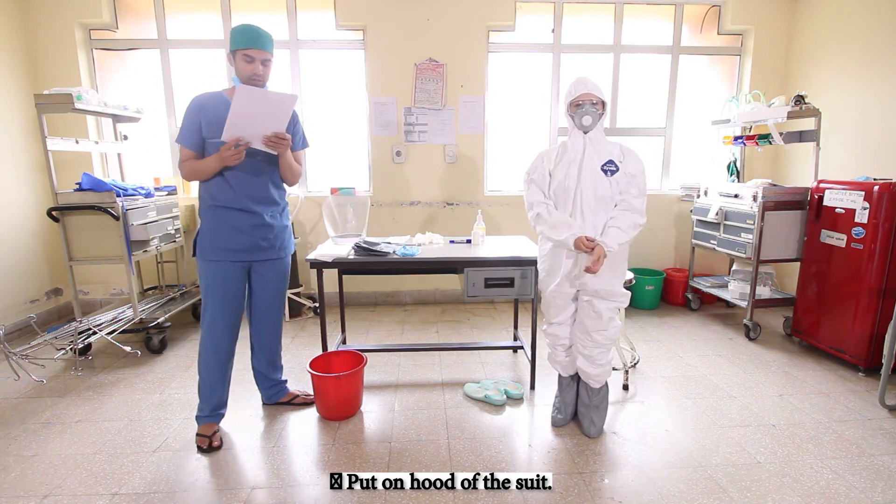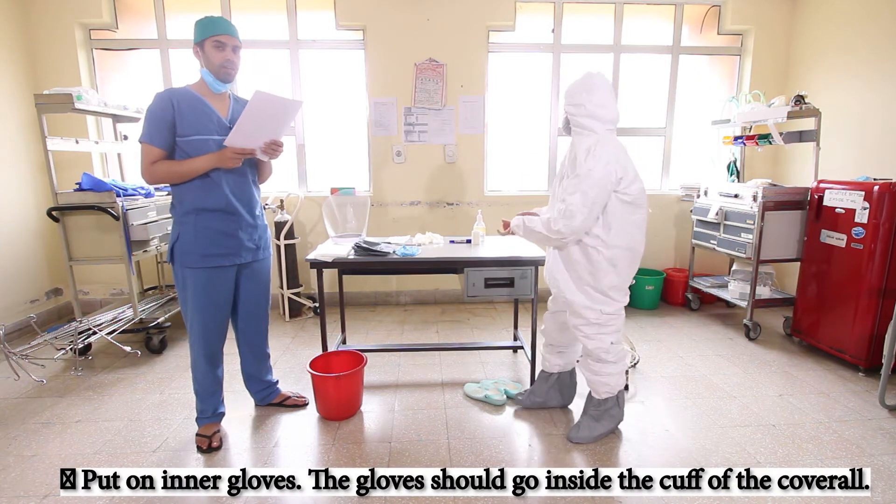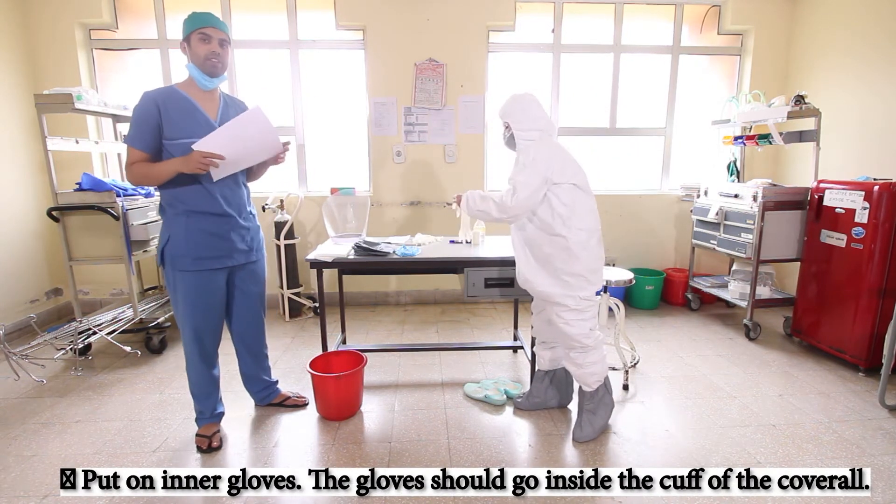Once we have done the suit, we shall move on to put on the inner gloves. Take care so that the gloves go inside the cuff of the cover.